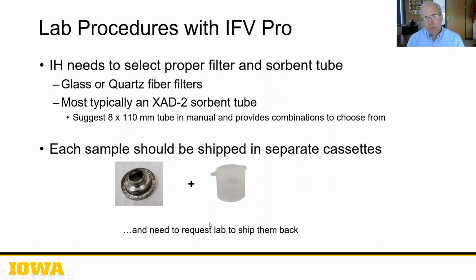So that keeps it simple there. And then, of course, you have this cassette here. You have to send that off with a filter in it. They provide you with this little container. But the first time we did that, we all of a sudden realized a month later, hey, where are our cassettes? And realized the lab didn't send them back. Well, so you have to ask them to send them back because they are worth money. So that's a little different than the OVS tube where they just toss that little glass tube into the trash.